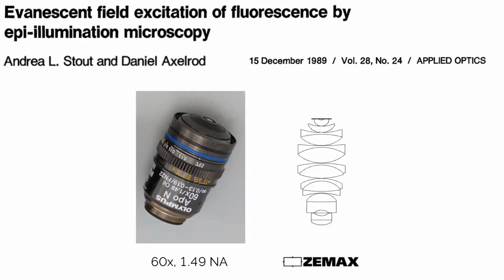Often, these optical elements are still polished and assembled into the objective lens barrel by the hand of a skilled technician. On the right is shown an optical model of the glass elements inside such an objective lens, composed using a lens glass and shape prescription in an optical ray tracing program like Zemax.